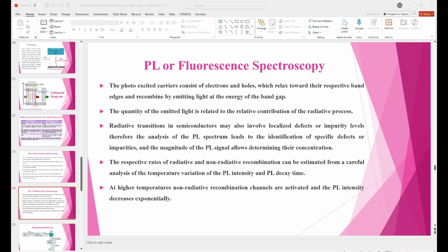You should be very careful that the cuvettes do not get scratched. If there are any scratches on the cuvette, each scratch will scatter your laser light, so the instrument will think that it is a particle. So if there are any scratches, you're supposed to change the cuvette. And the polystyrene latex is a disposable cuvette, so never use any organic solvent to clean your cuvette. If you use a polystyrene latex cuvette and clean it with organic solvents like acetone, immediately your transparent cuvette will turn cloudy and your cuvette will be destroyed.